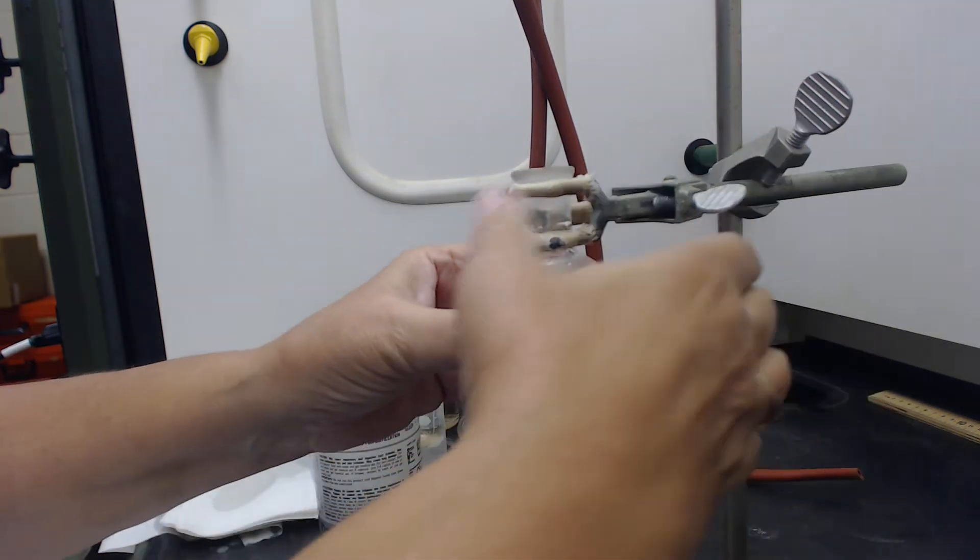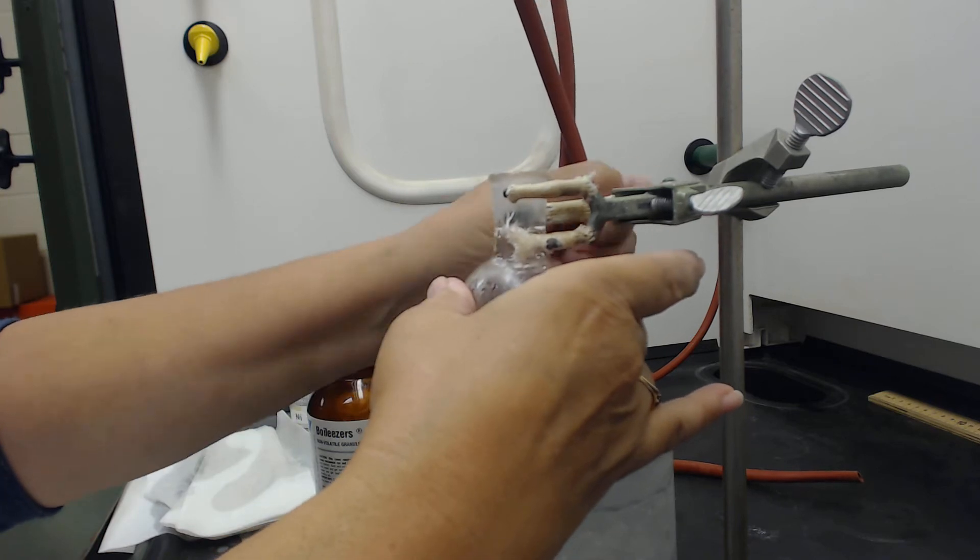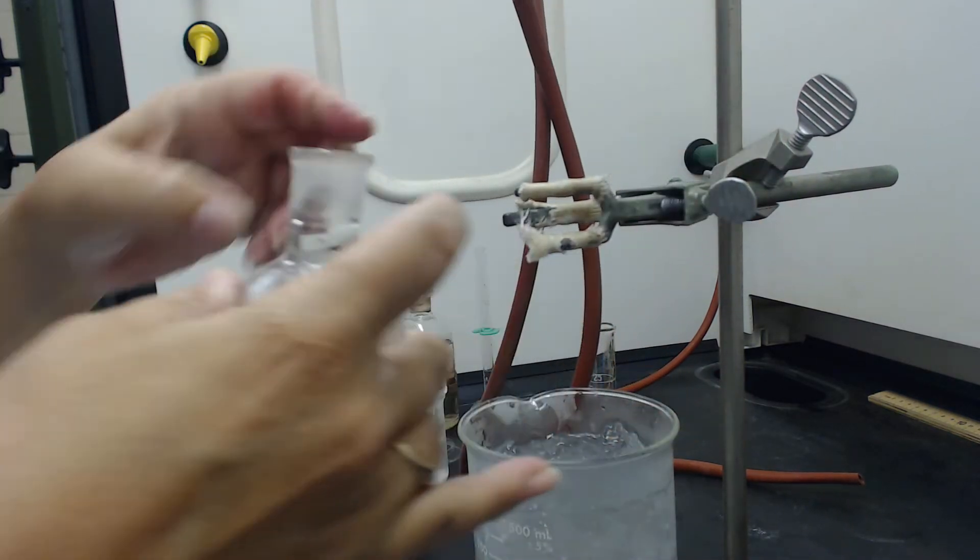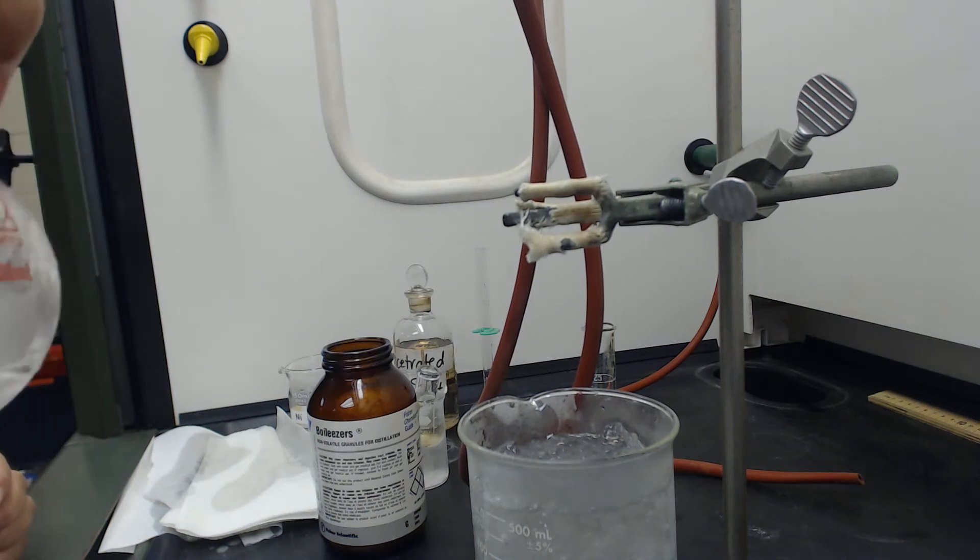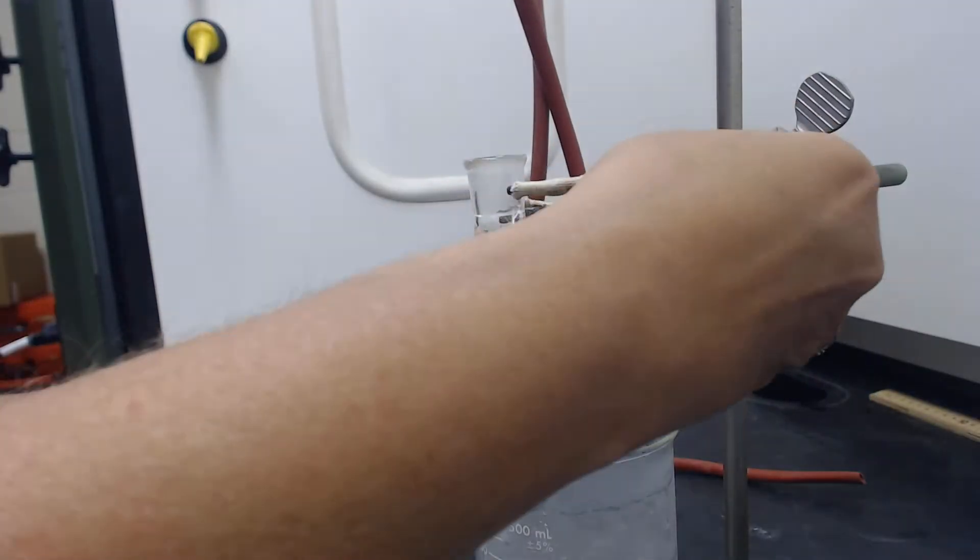Now I've added the 10 milliliters. Let me stir it a little bit. It's hard to stir. Some people have a stir bar put into here. Let me just give it a little mix, make sure it's all mixed well.